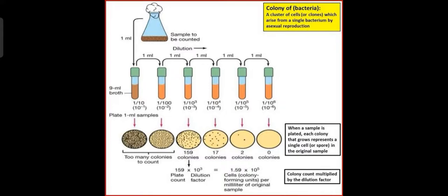Once you get the colonies, you can count them and multiply with the dilution factor. The counted cells can be represented in the unit CFU, that is colony forming units.